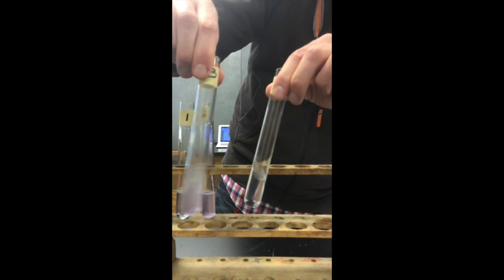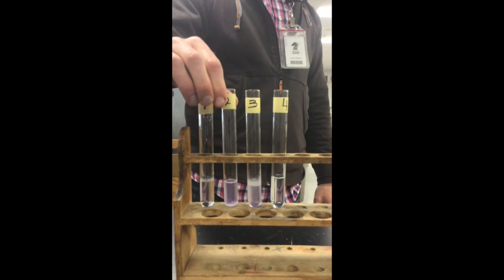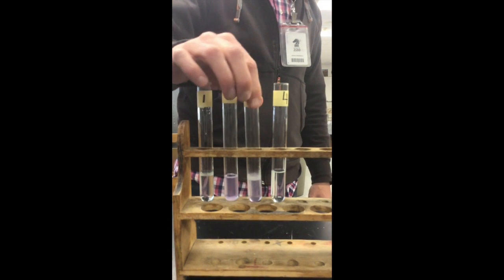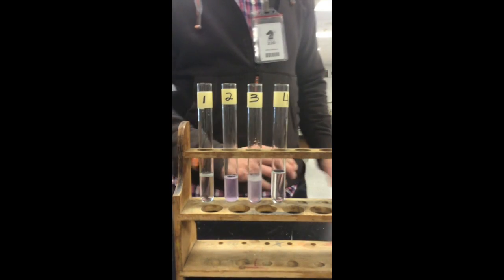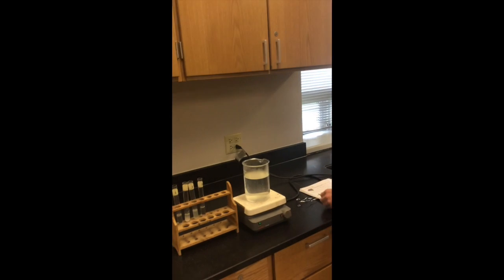if the color turns to, bear with me here, purple, then we know protein is present. So far it looks like, just initially speaking, there might be protein present in unknown 2, and there might be protein present in unknown 3, but we're going to let that sit for a few minutes before we record our data. All right, let's go to test number 4.